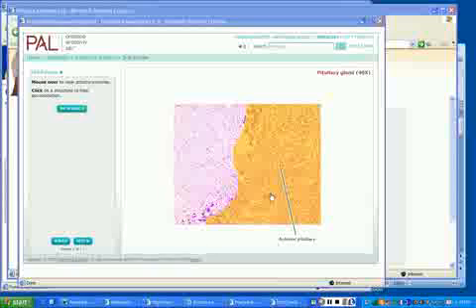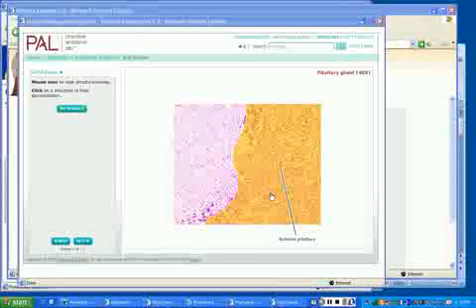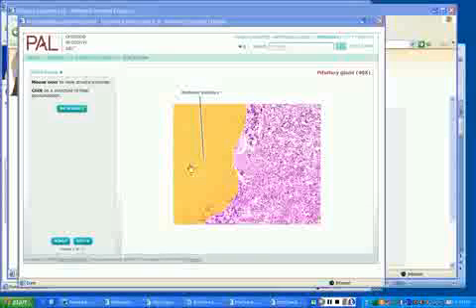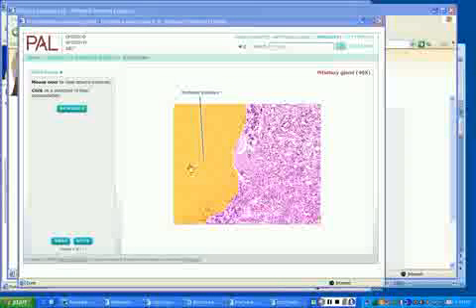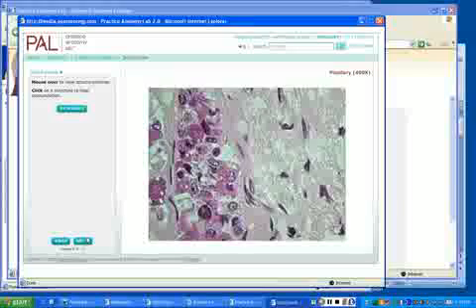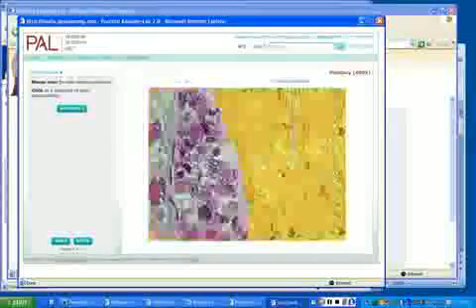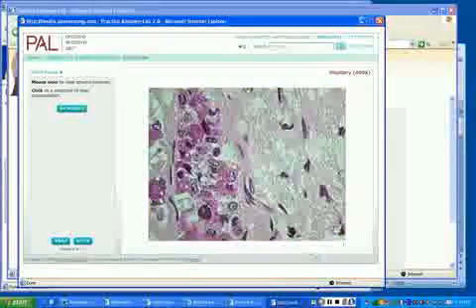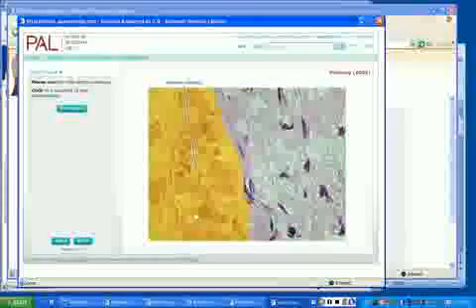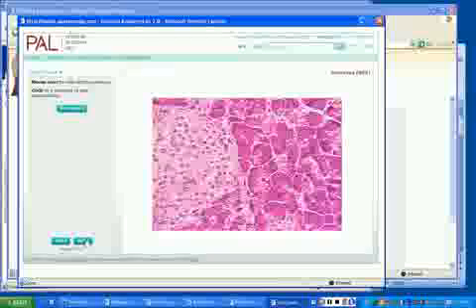Name this tissue. What kind of tissue? How about just cuboidal epithelium instead of simple cuboidal? Because it's not actually simple cuboidal. Cuboidal epithelium, and what about this tissue? Nervous tissue. Nerve tissue or nervous tissue would be fine. Wow, look, they zoomed up right on the border between the two here. And you're barely seeing any, but you can totally see cuboidal cells versus long, skinny fibers. So that's nerve tissue, and that's cuboidal epithelium. Don't worry, my scopes don't go that tight. Aha!